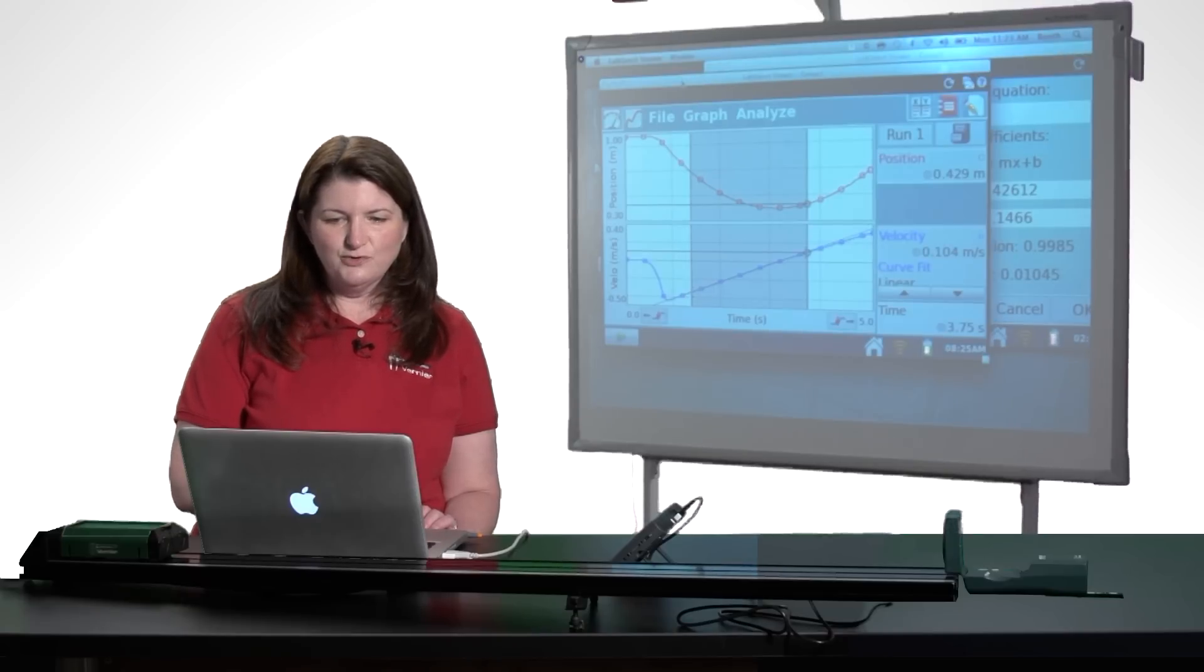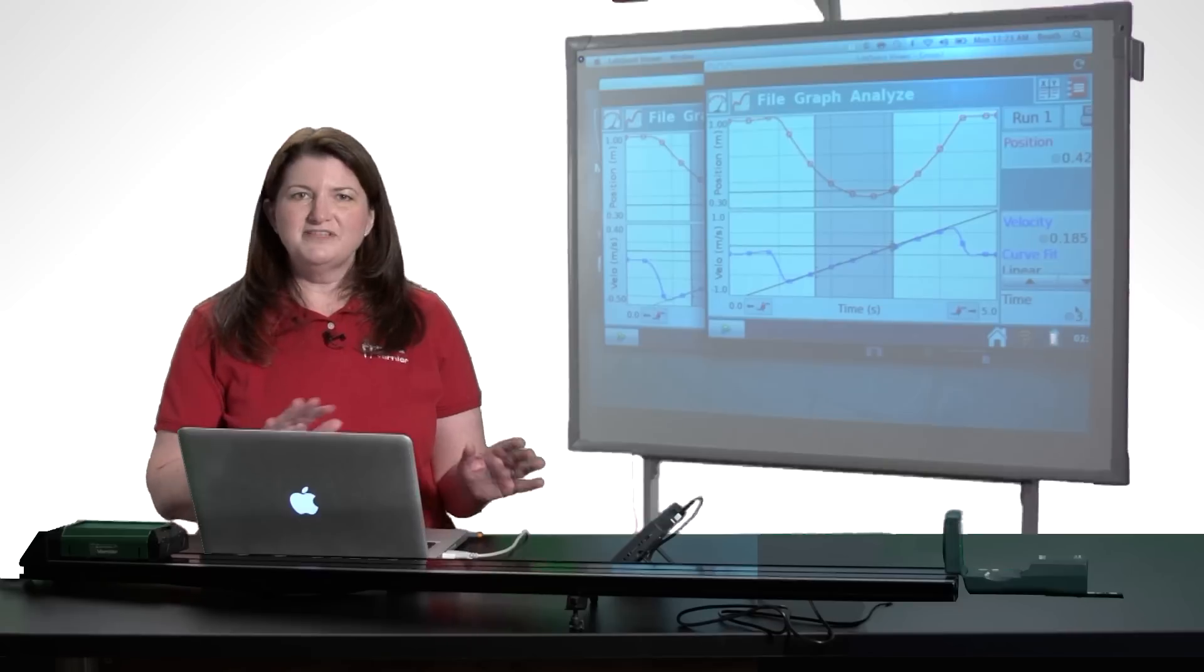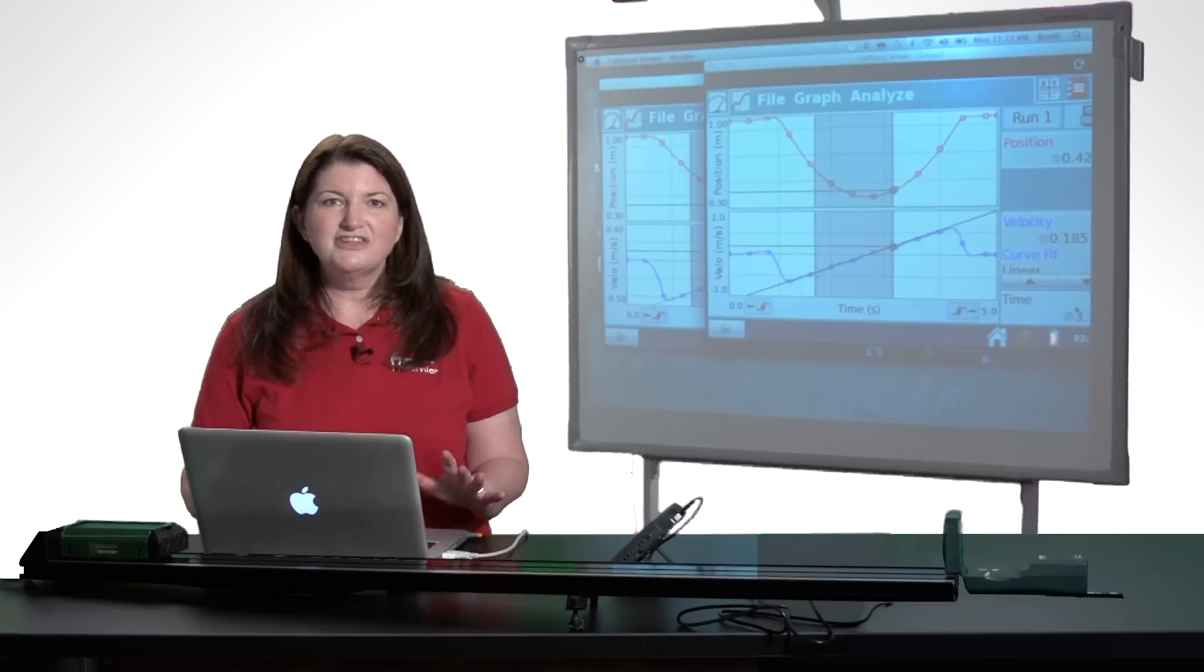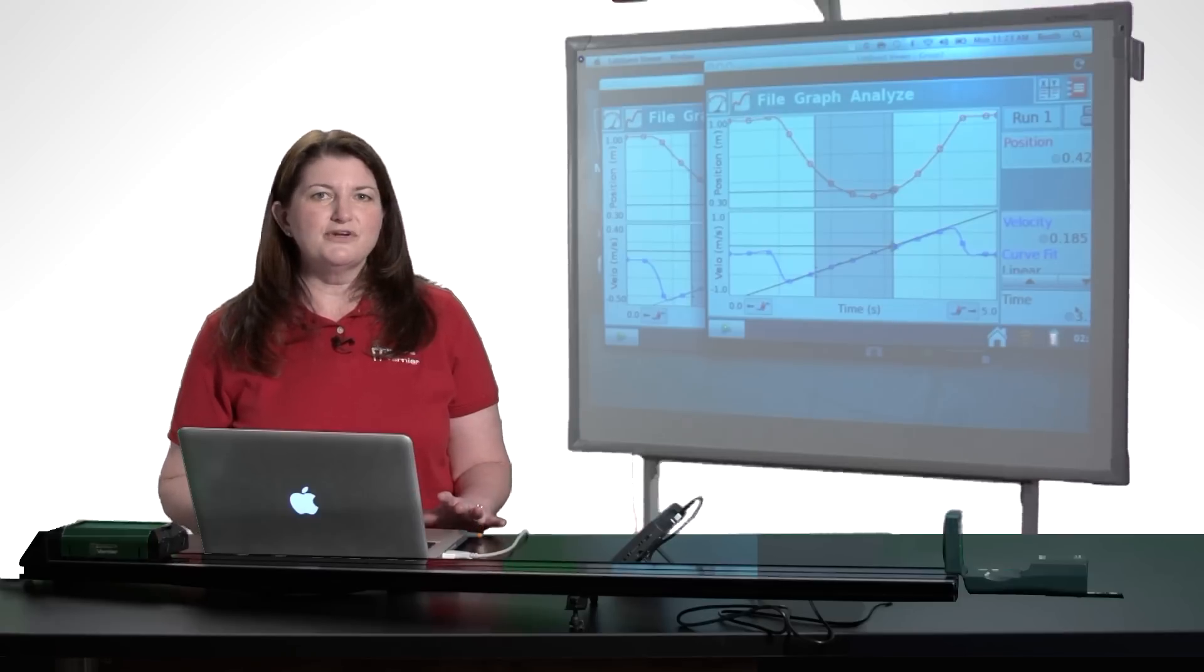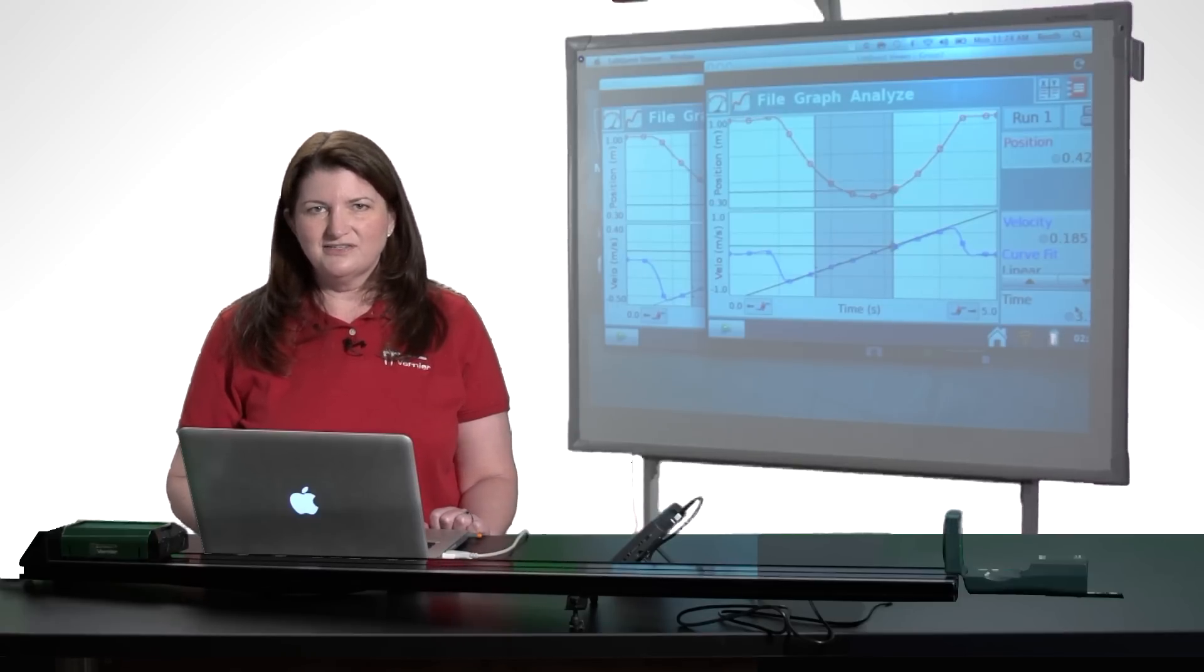This was my data, group one. You can see that right here at the top of the window. And the other window is group two. Go back and forth and compare data from different groups. That's a very good thing to do, especially in inquiry labs where you have different groups doing different things. Talk about all the different data they're getting. So it's a very useful tool.